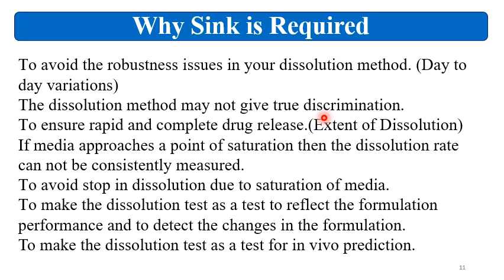To ensure the rapid and complete release of the API, that means to achieve the extent of the dissolution, the sink conditions are required. If media approaches the point of saturation, then the dissolution rate cannot be consistently measured. Also, to avoid the stop in dissolution due to saturation of the media.